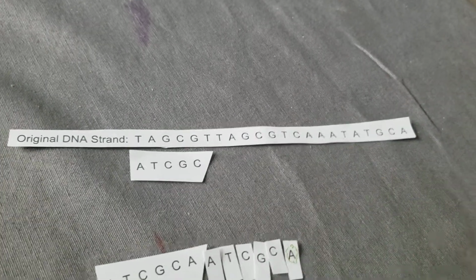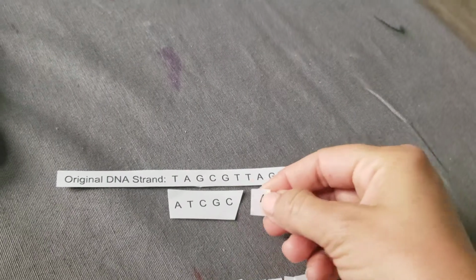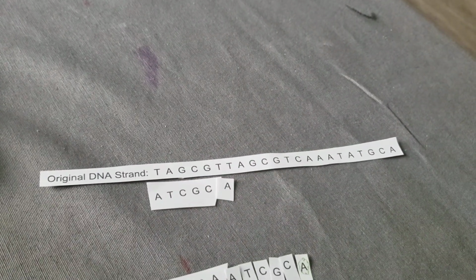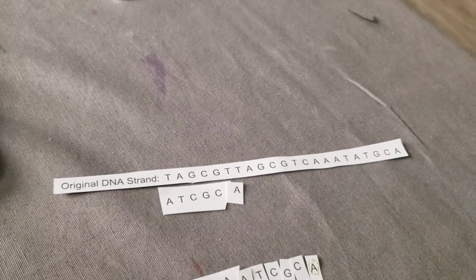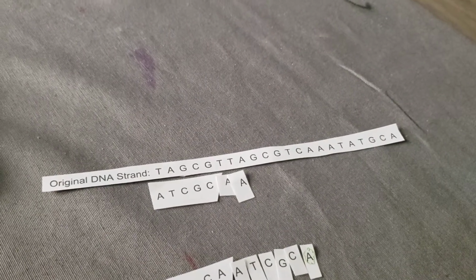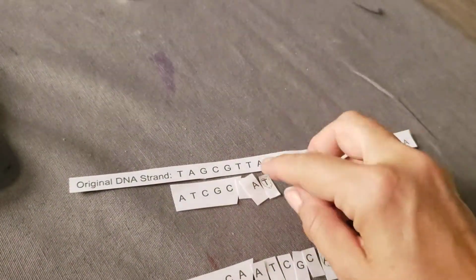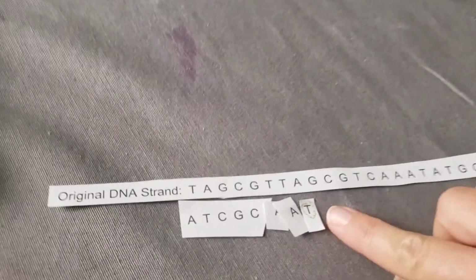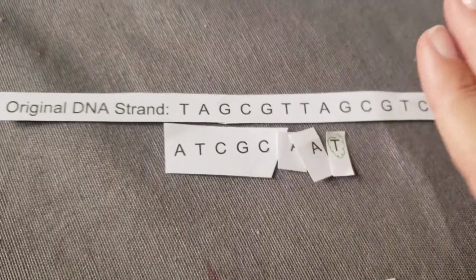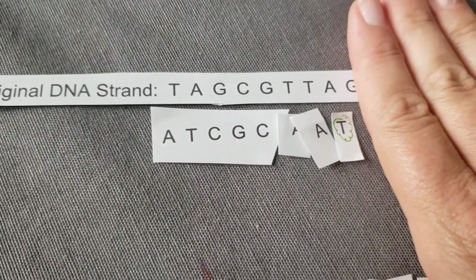As it moves down the length, it's grabbing random nucleotides to fill in all of the spaces as it builds. It's doing what it should be. It actually proofreads to make sure it doesn't make mistakes. And lo and behold, look what happened. It just so happened to grab a fluorescent thymine right here. So once again, that's going to truncate the double-stranded DNA right at that point, okay?